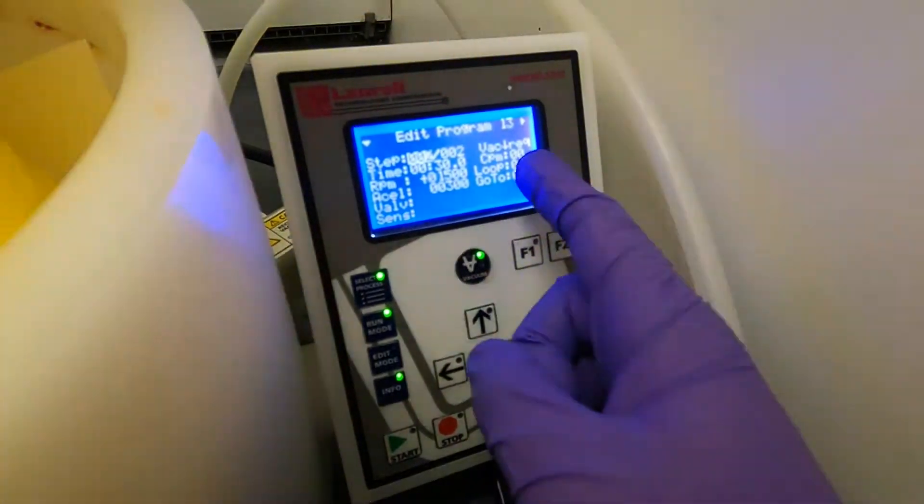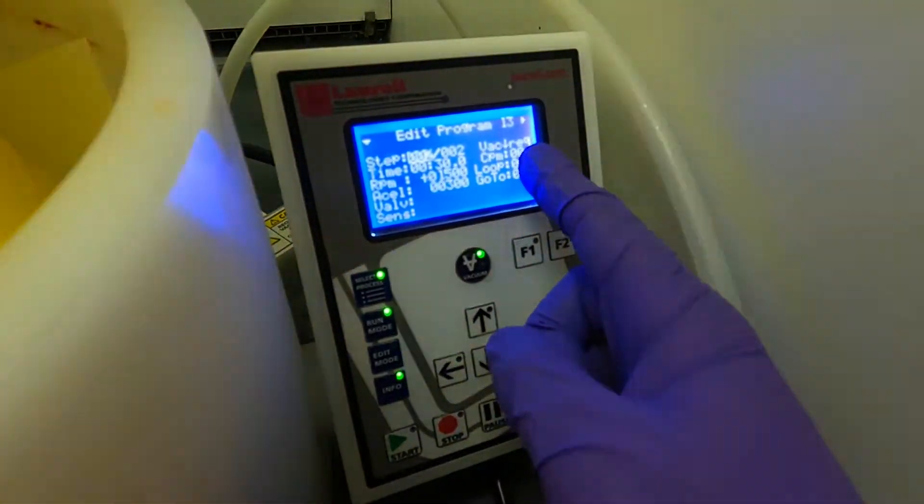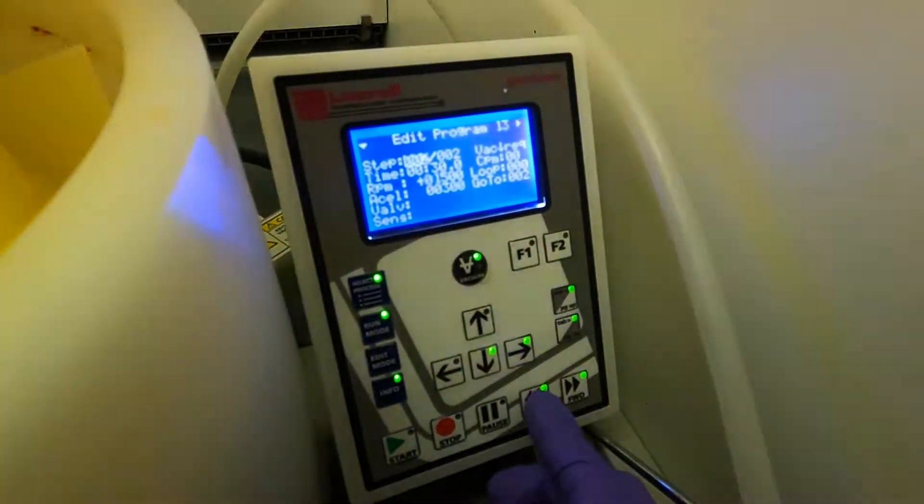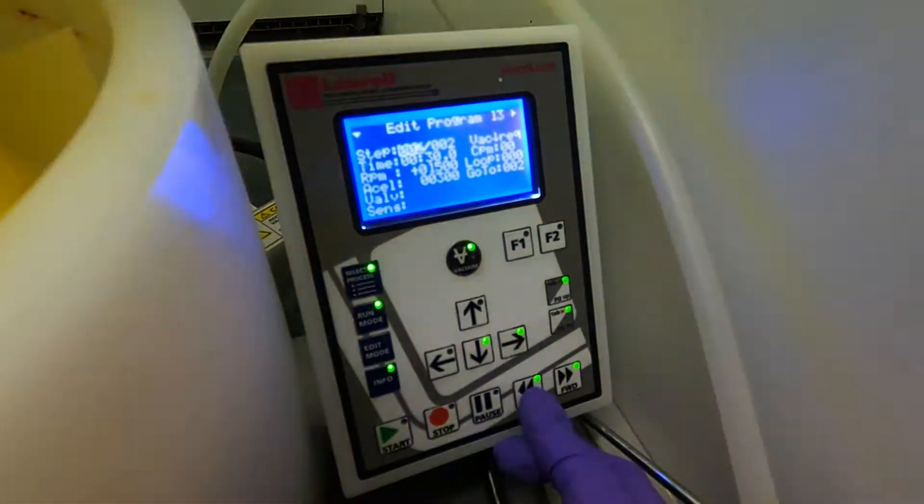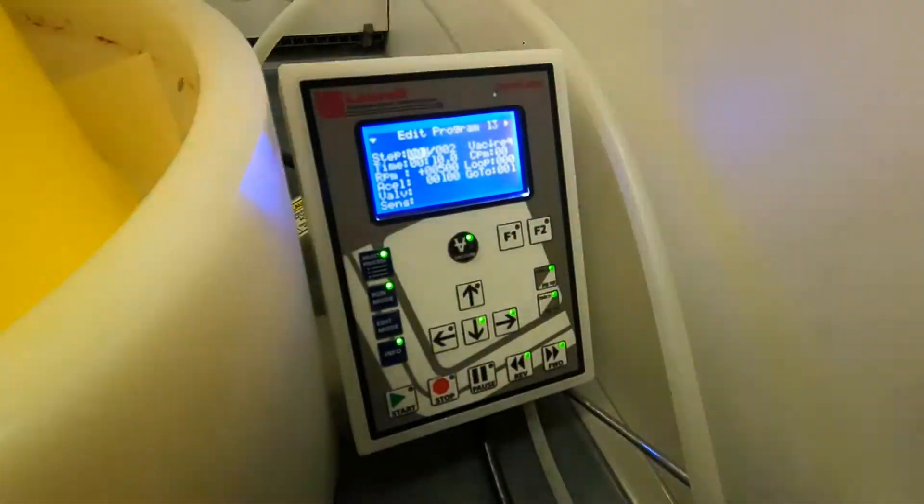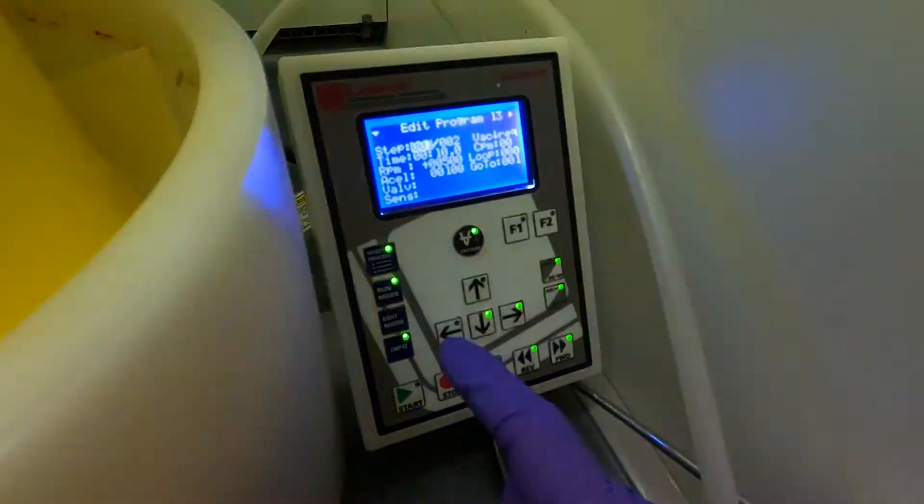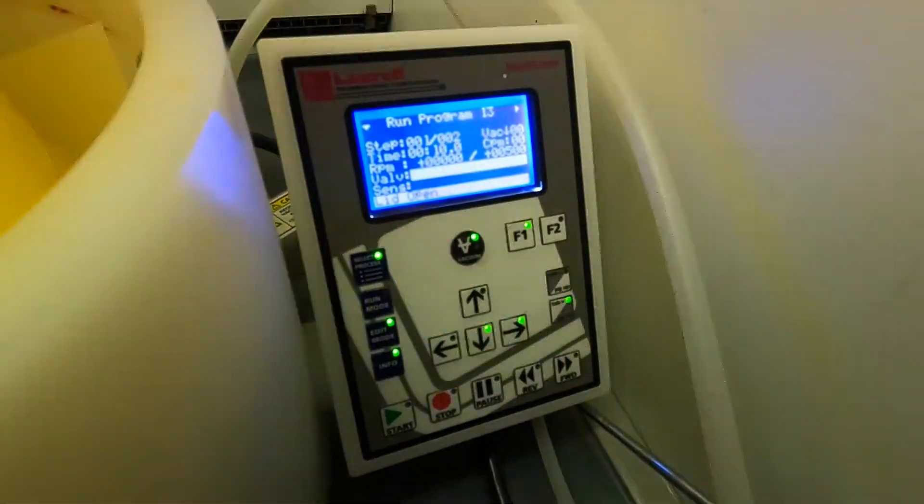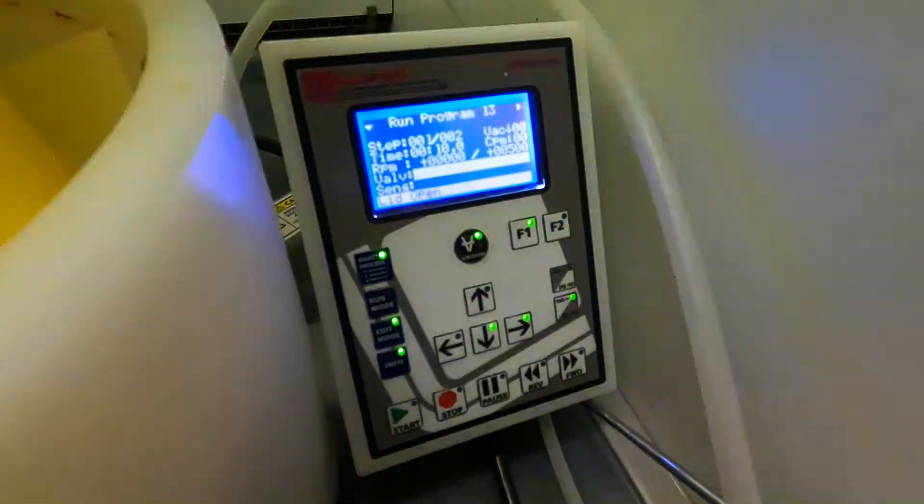Throughout this whole thing you see that we have this vacuum option and we always want to keep that option as required for both the first step and the second step. So this now has the settings that I want, so I'm happy with that. I can switch now to the run mode and this will make the spin coater ready for spinning.